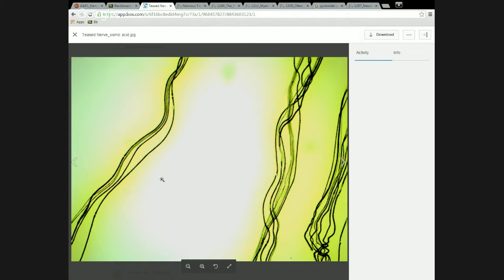Those are some good examples of what they look like. I just wanted you to make sure that you see that there is quite a bit of distance between those gaps, which will be important when we talk about how the electric signal travels along the axon, okay, which will be a topic for next week.